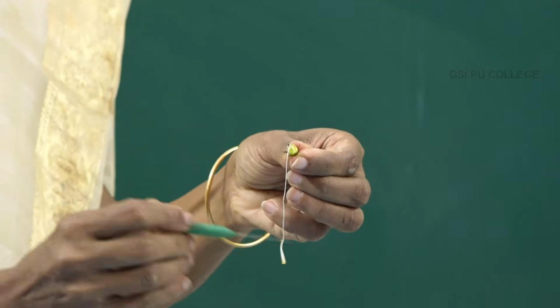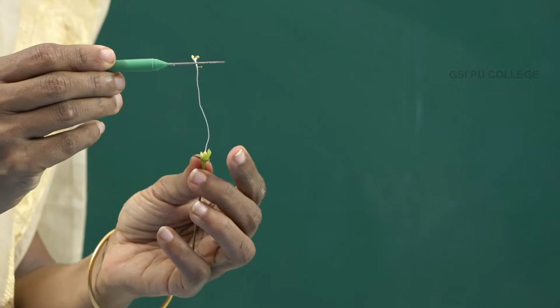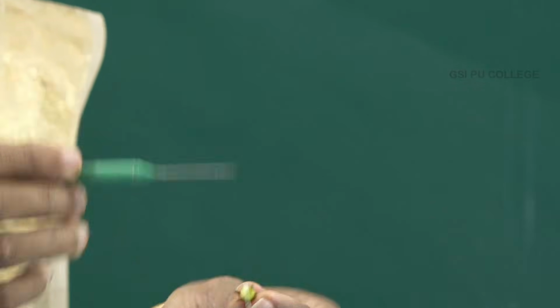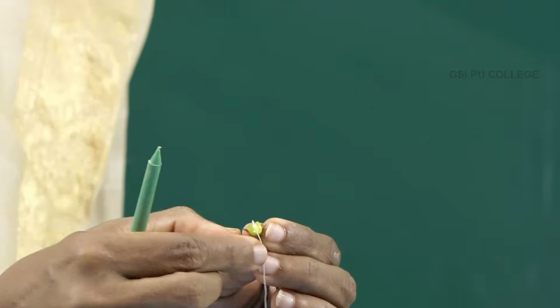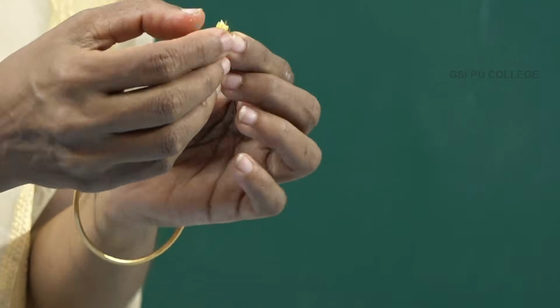Now this is the ovary, the elongated part is the style and the terminal part is the stigmatic surface. So, the carpel consists of 3 parts: ovary, style and stigma. Now in the examination we will provide this part.